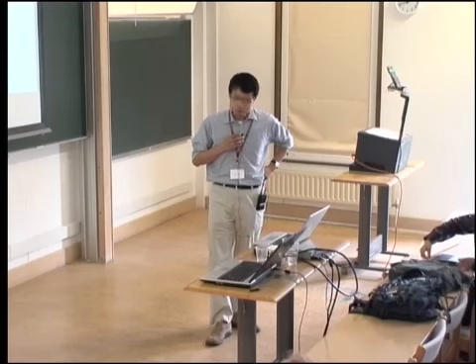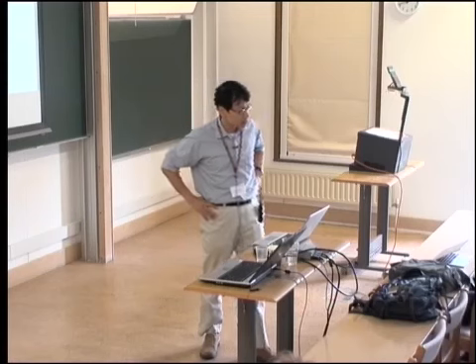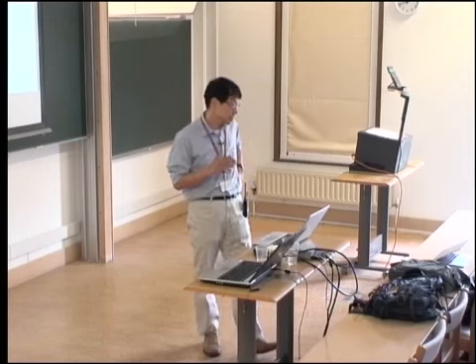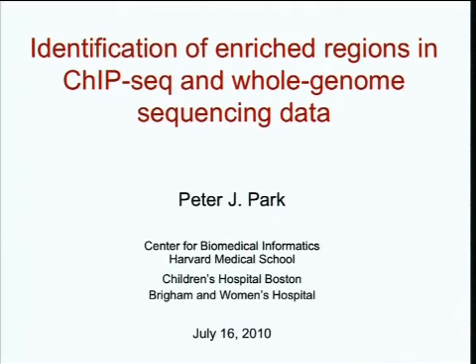All right, so I'd like to tell you some of the things that we've been thinking about in terms of ChIP-seq analysis. And knowing that a lot of people here are interested in whole genome sequencing data, I thought I would talk about a method that we've developed that's applicable both to ChIP-seq and whole genome sequencing data analysis.